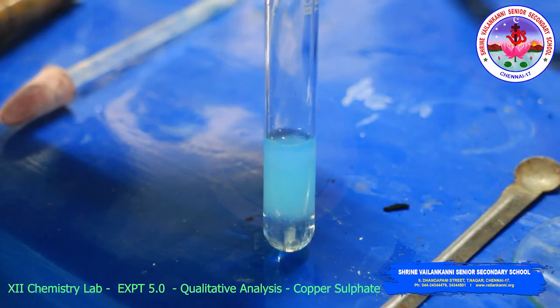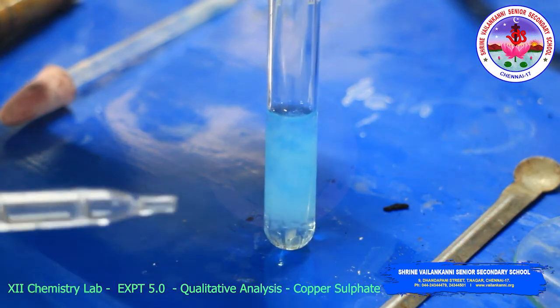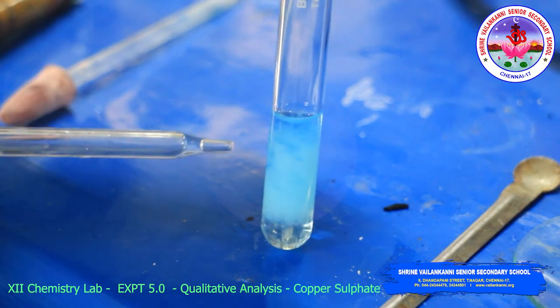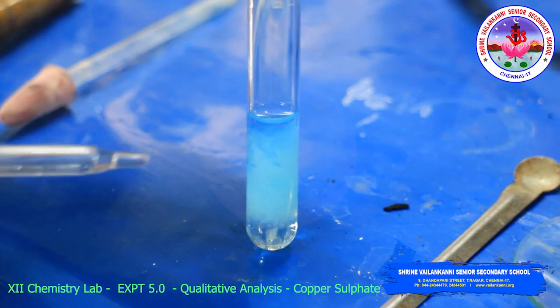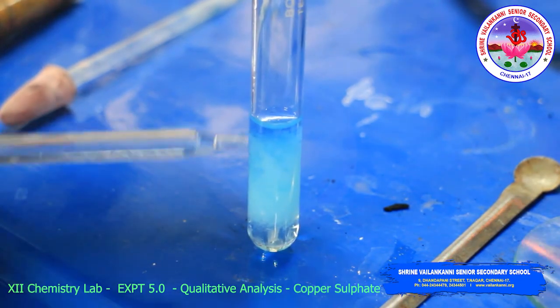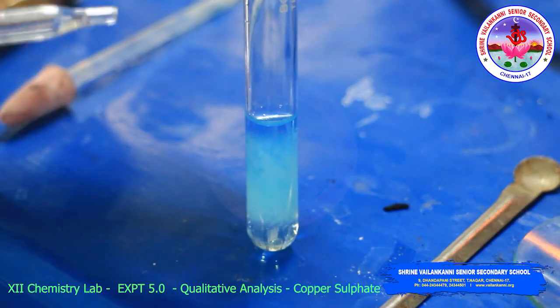When excess ammonium hydroxide solution is added, only the blue color appears. Look at the blue colorization. Can you see it? The blue precipitate is at the bottom and the blue colorization is in the top layer. So this indicates copper is confirmed.